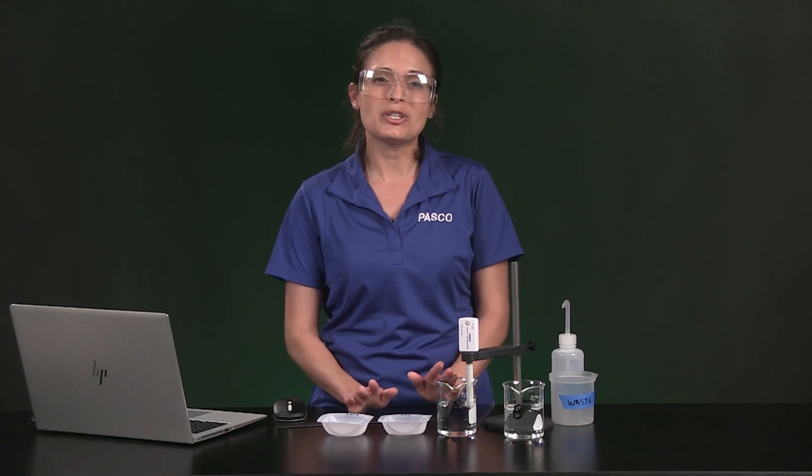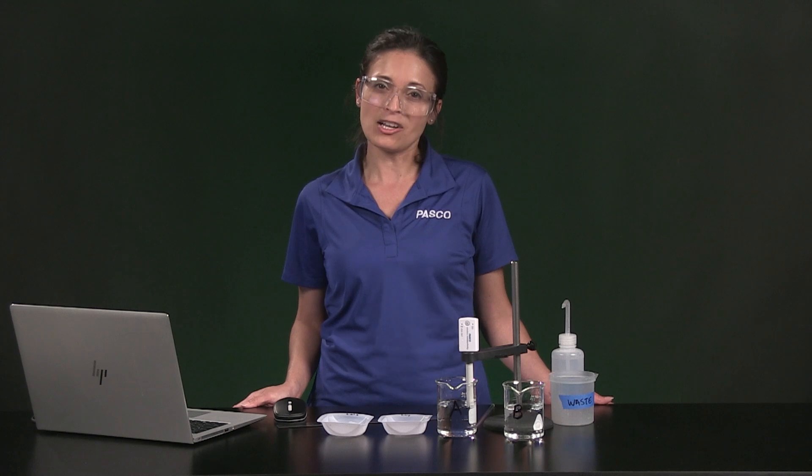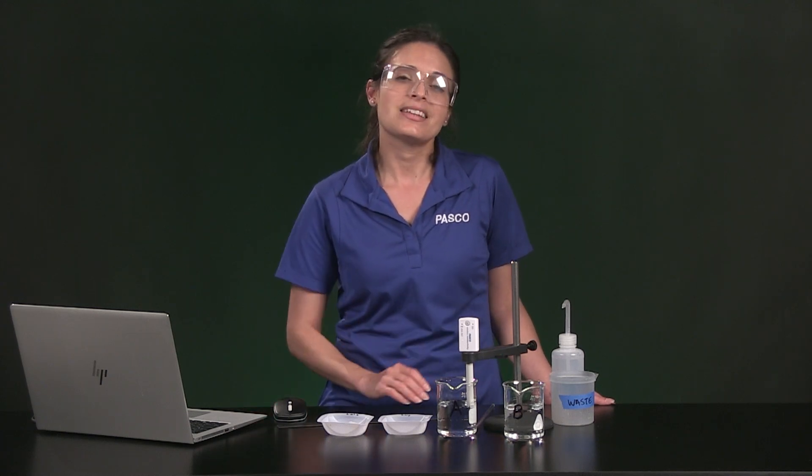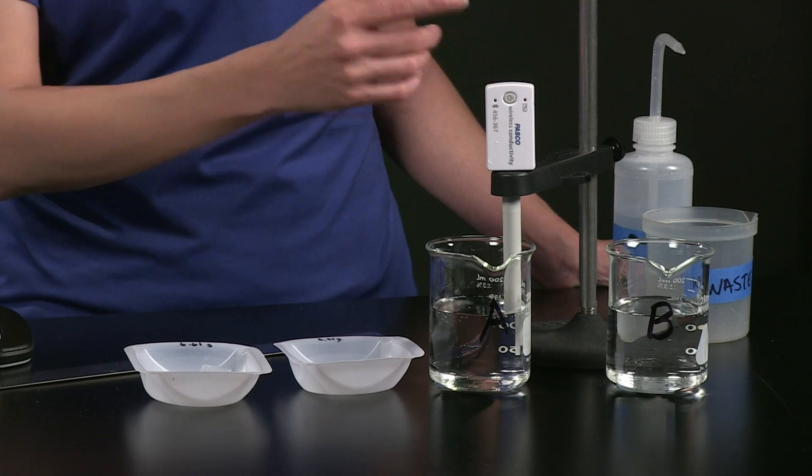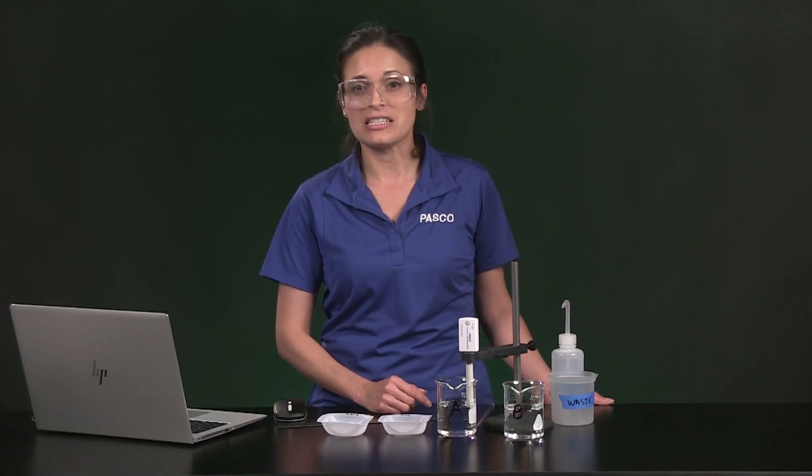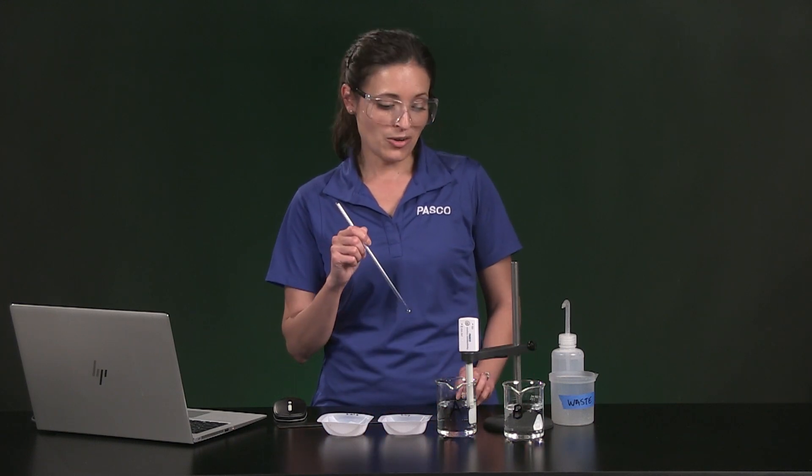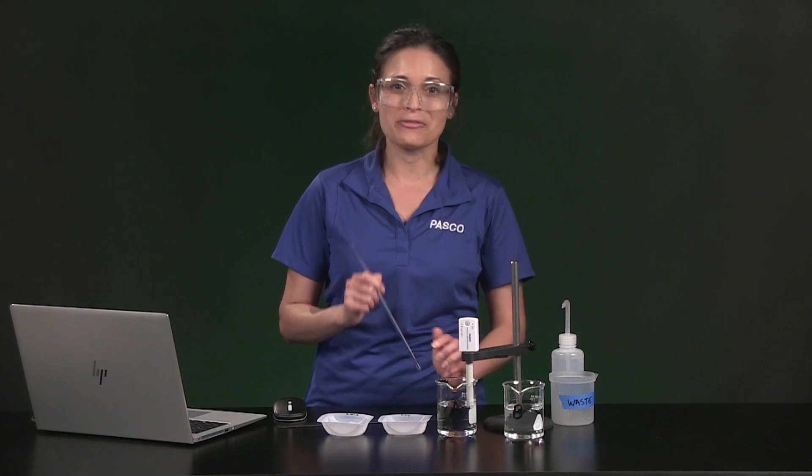Now we are ready to put these cubes in 150 milliliters of distilled water to see how fast the salt will dissolve out of each cube sample into the water. This conductivity sensor will detect those sodium and chloride ions that appear when salt dissolves into the water. I am going to stir by hand with a stirring rod, trying not to hit the cube or the sensor for 5 minutes.